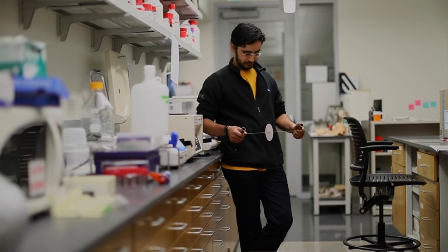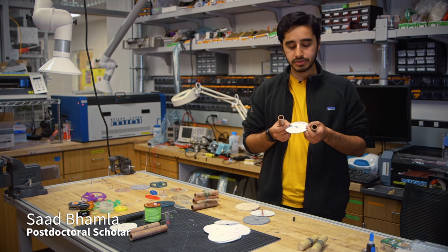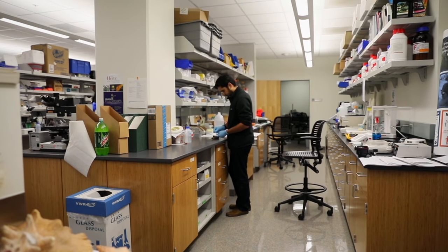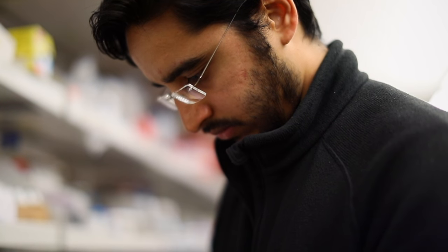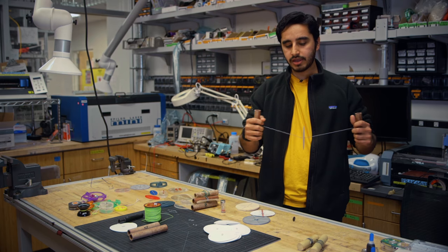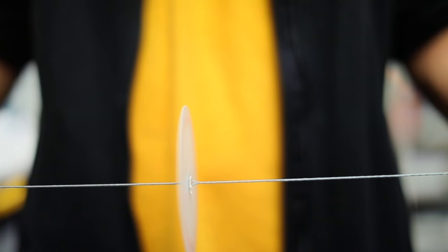We call it a paperfuge. It's essentially a piece of paper, and we put in small holders for capillaries that we can fill with blood. We have standard string, and we take two pieces of either PVC pipe or wooden handles, and then you just pull on it gently. As you spin, the disc is rotating back and forth in an oscillatory fashion — there's a moment when the disc is stationary, and then it starts to unwind and go in the other direction as you apply a force.